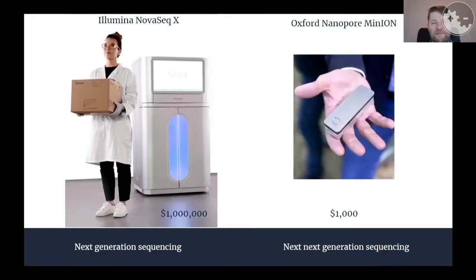DNA sequencing started in the 70s when people used to do things entirely by hand, not unlike computing with the abacus. Then, in the late 90s, the process became automated, and somebody in marketing decided to call this next generation sequencing, which was clearly the most future-proof name ever. NGS is kind of like the mainframes of sequencing. The NGS machines are expensive, but also very high throughput. They live in core facilities and are run by people with many academic titles who wear white lab coats.